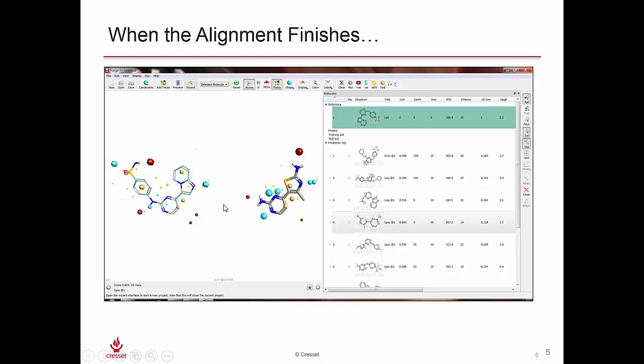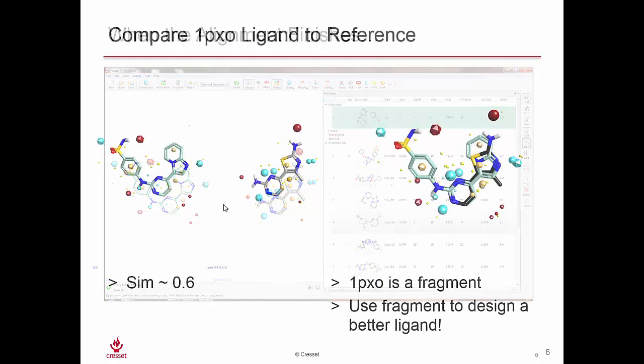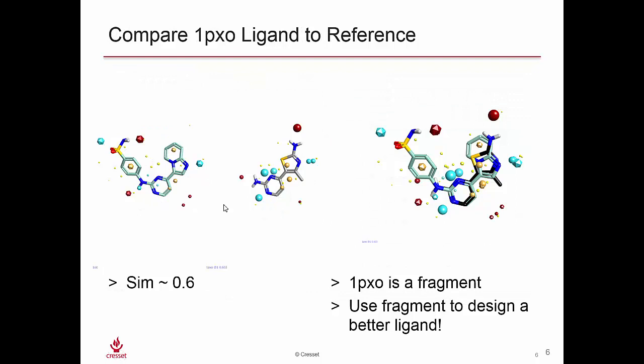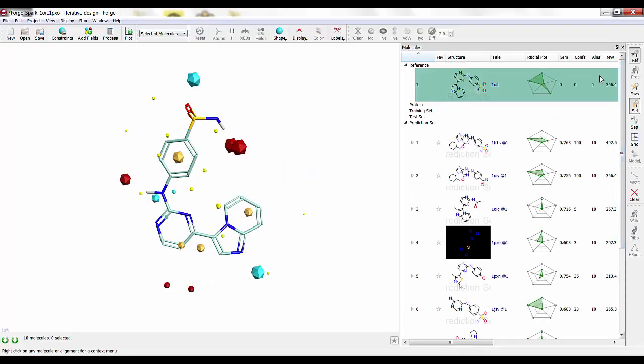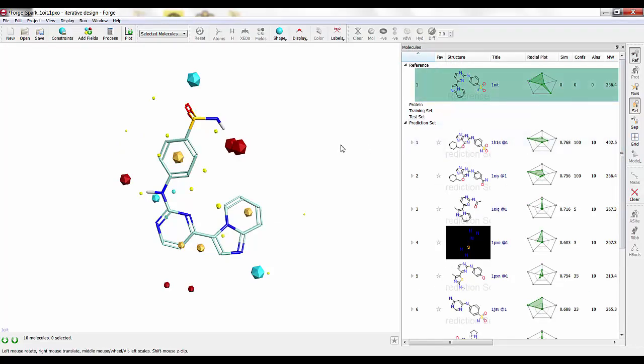So just to recap, we've got our 1OIT reference structure, we've got our ligand fragment that we're going to start with, and I'm showing them overlaid here to show where the connection is happening. We've got this fragment that's aligning well with this section of the molecule, and we're going to grow out towards this end of the molecule.